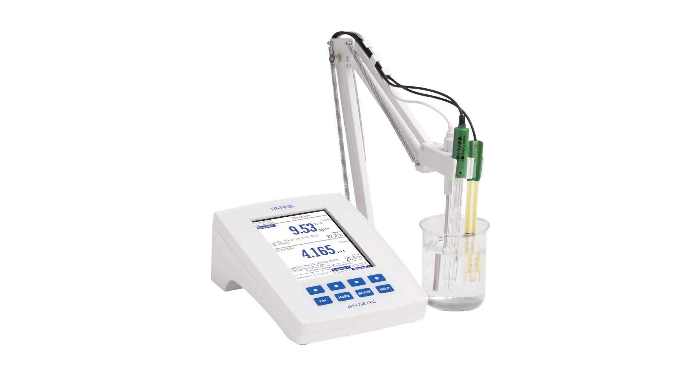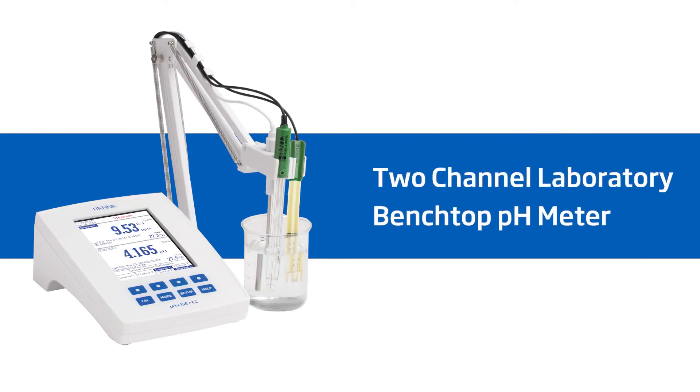Hi everyone, I'm Doug with Hanna Instruments, and today we're going to go over the Hanna Instruments HI5522 two-channel laboratory benchtop meter.